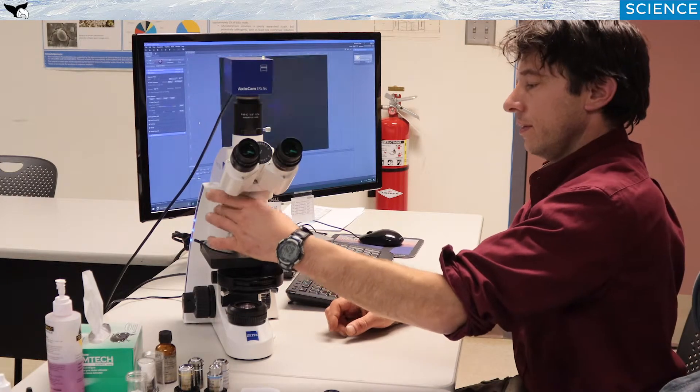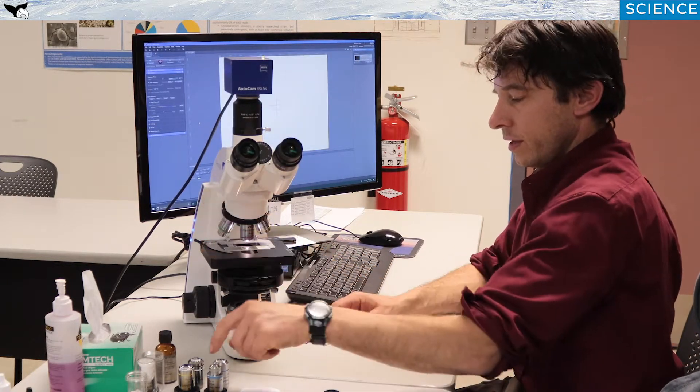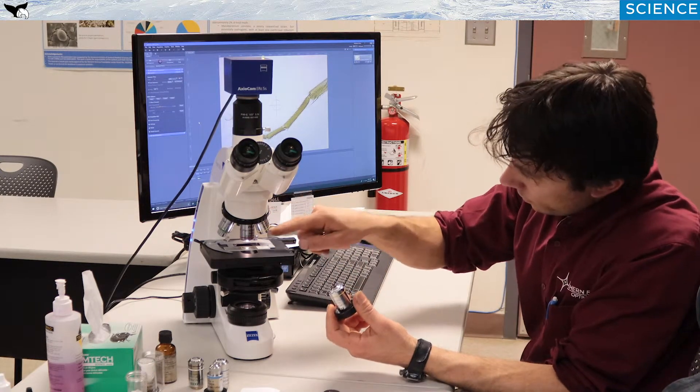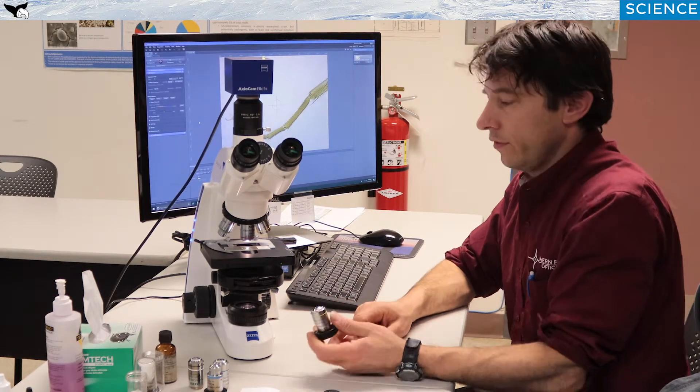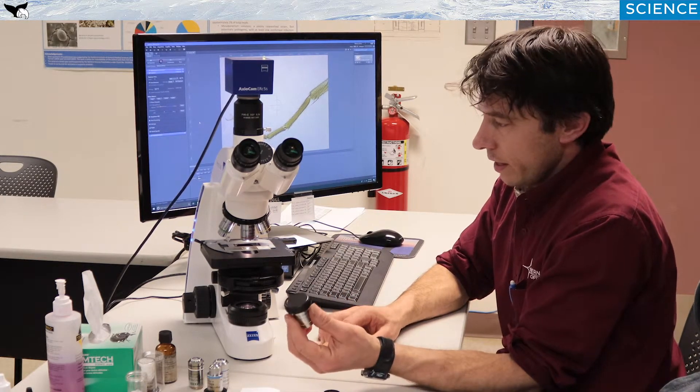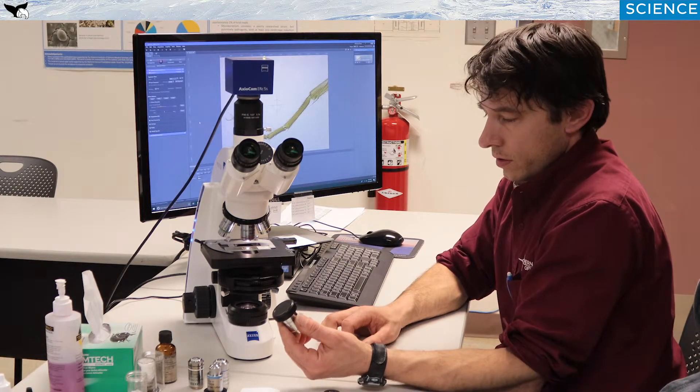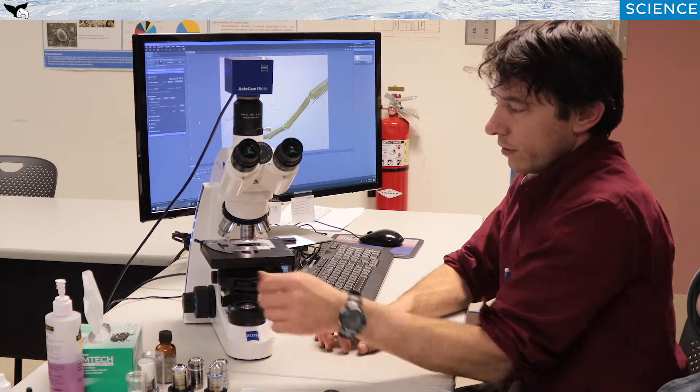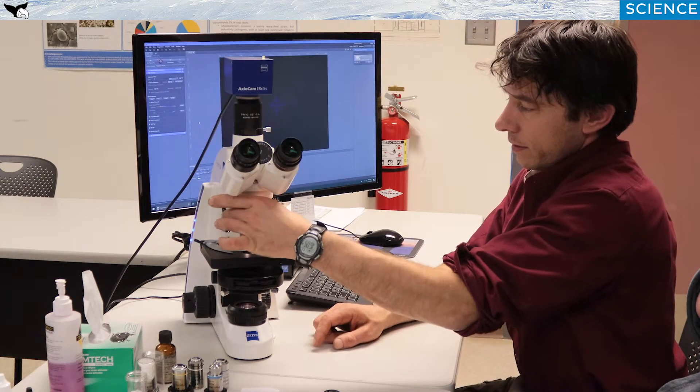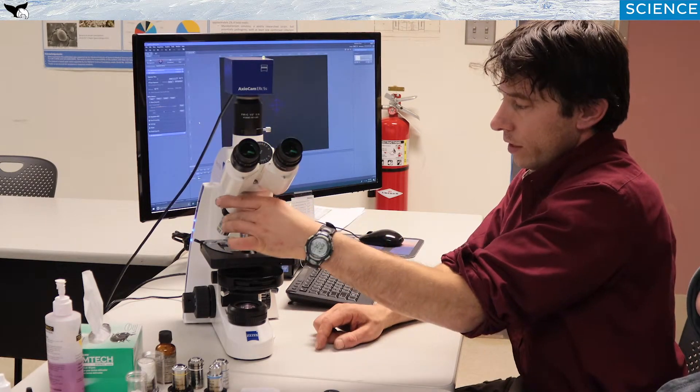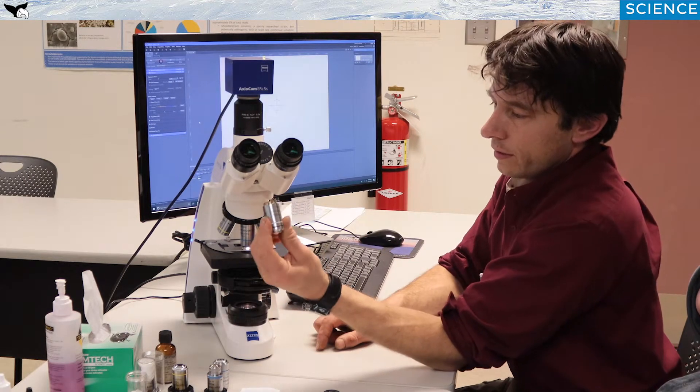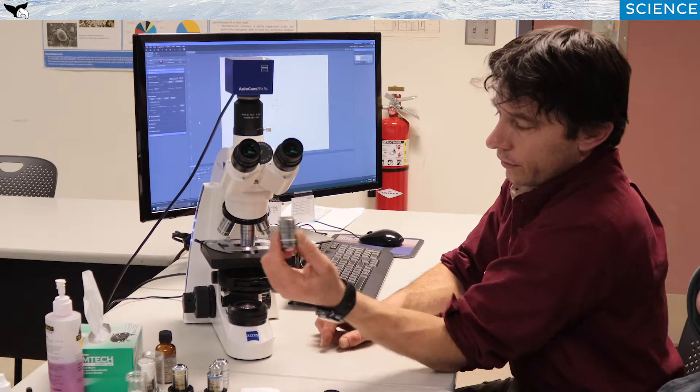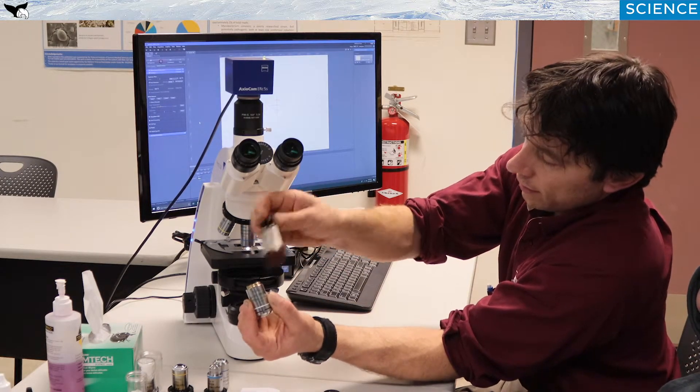The next is the objective turret. And on the objective turret, you can see these cylinders look like this. And they have different colors and numbers on them. And that's all really important stuff. Basically what these are objectives. And they are the first area of magnification that we have. And the common configurations on a student microscope are a 4x, in this case then a 10x, a 40x, and then typically sometimes you'll get this really high one. It's a 100x magnification. And we typically utilize immersion oil along with this and only this objective.